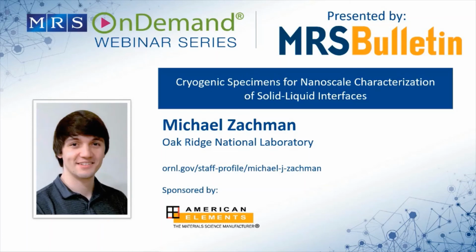But if you have to include FIB preparation, like what I did and what I showed, you freeze your sample and put it into the FIB. And we had a load lock. We used a Quorum load lock. And you put that in through the vacuum system into the chamber of the FIB, and then prepare it. And on the way out, there's a little vacuum transfer device that goes from the preparation chamber on the FIB to a nitrogen pot.